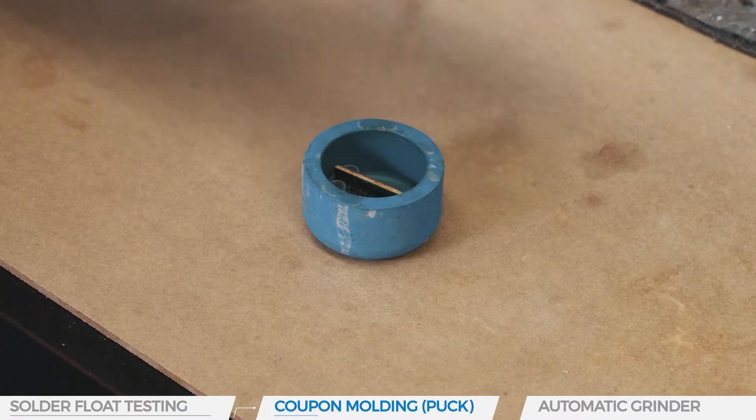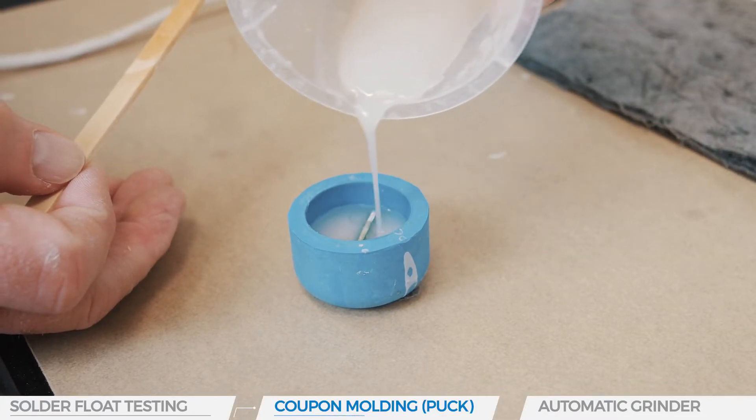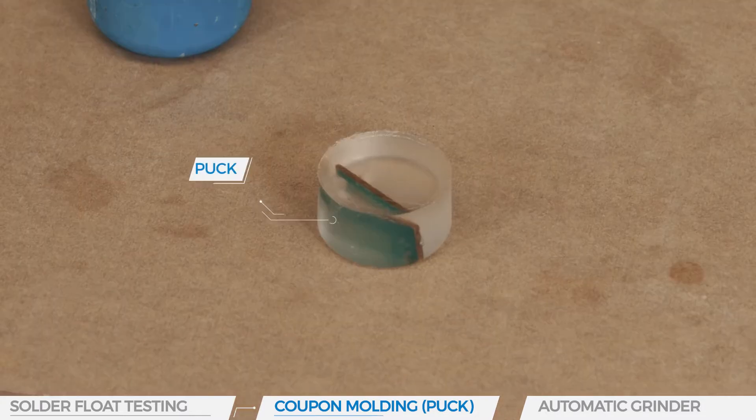The coupons are mounted in an acrylic resin which is then cured. This is called a puck, simply because it looks like a hockey puck.